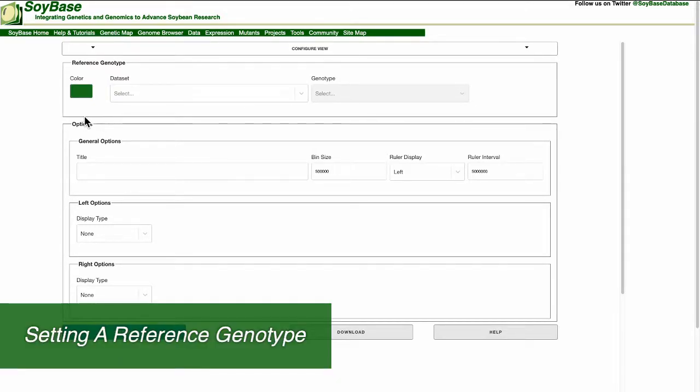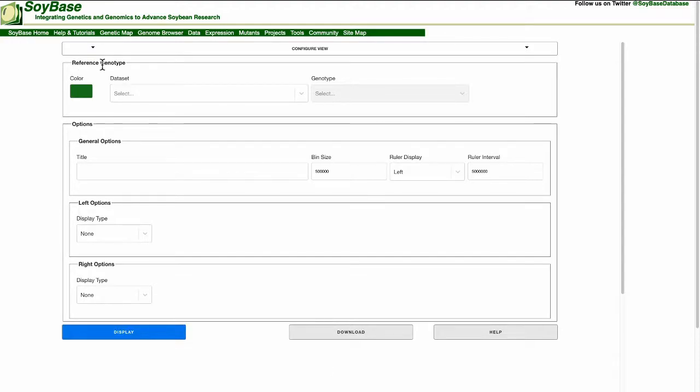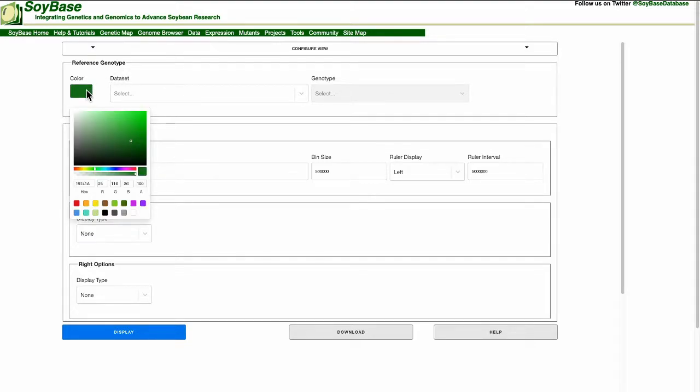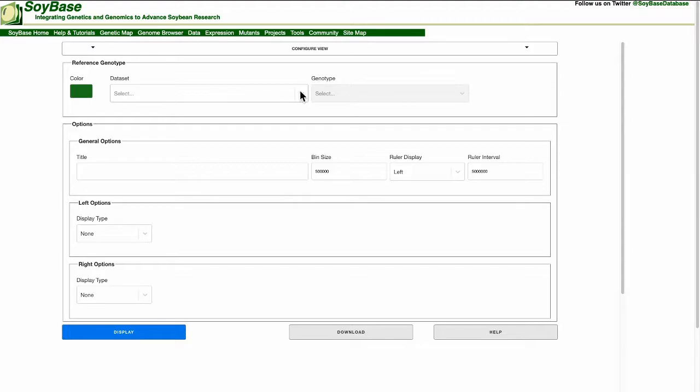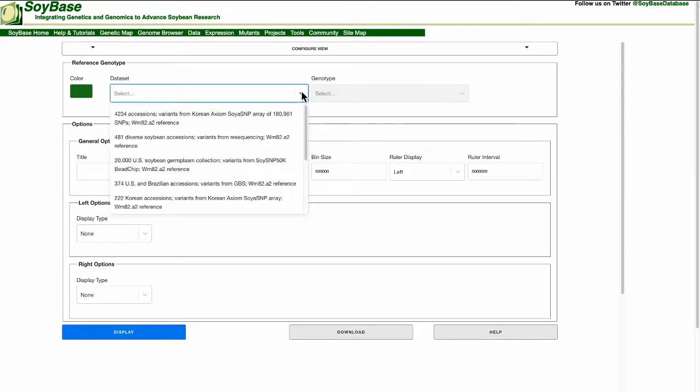Let's go through an example to show how GCivit works. The first step is to select a reference genotype. First we select a color to represent the reference genotype. In this tutorial I am going to use the default green color. Next we select a data set to select a line from.